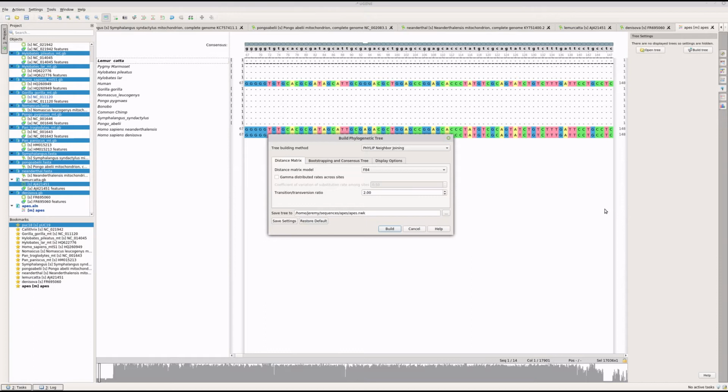And so what we will do now is you can see right now the tree building method. There's a drop down. There's something called MrBayes, which uses Bayesian statistics and inference, right? That is a nice evolutionary model system because it takes into account what we call priors. Things that happened earlier are predictive of things that will happen later, and that makes total sense. There's something called PhyML, and ML stands for maximum likelihood. That's another statistical methodology of looking at these relationships.